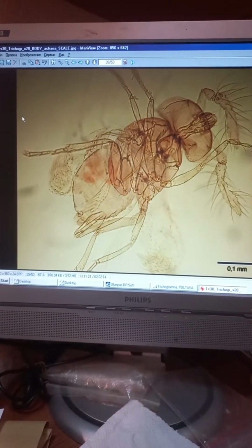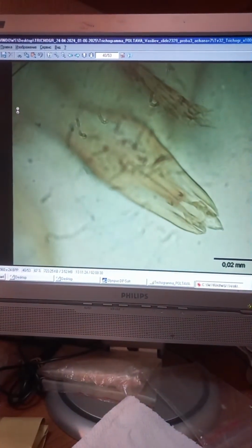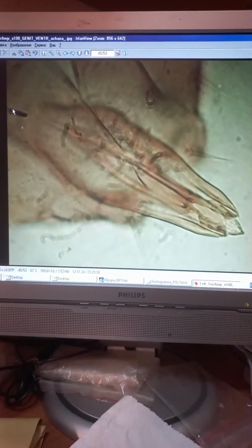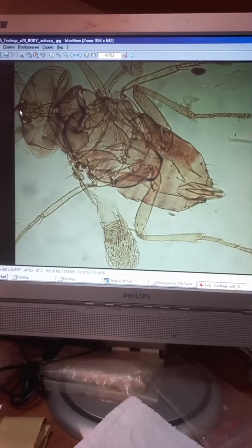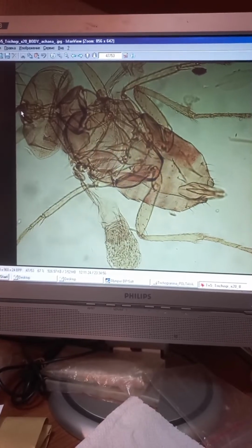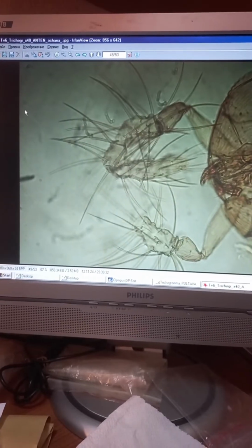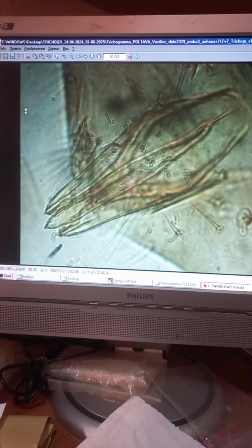Okay, this is a male Trichogramma achaeae under 200 magnification. Antenna, again male. This is 1000 magnification. Here 200 magnification, male with shorter wings, but it's okay, wings are not used for identification. Structures of antennae and genitalia are used. Again, antennae under 400 magnification. Here 1000 magnification.